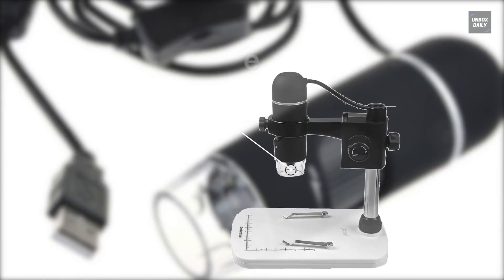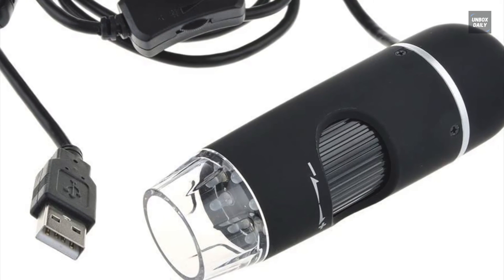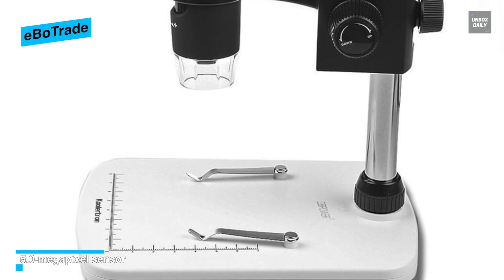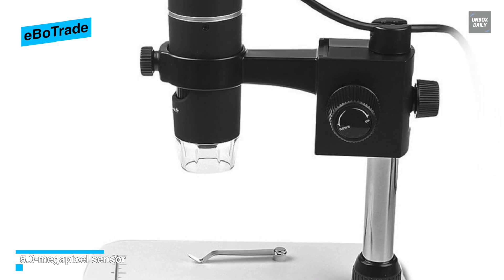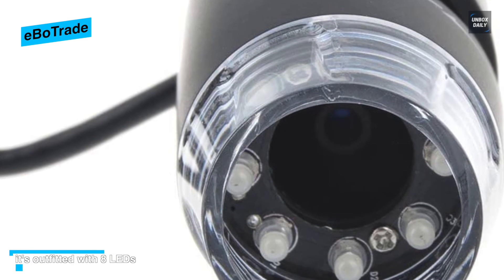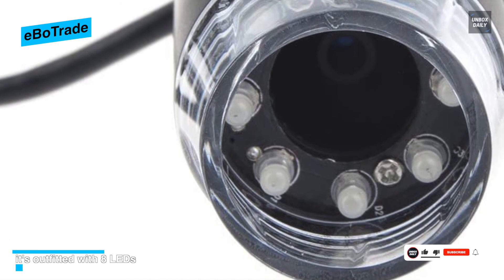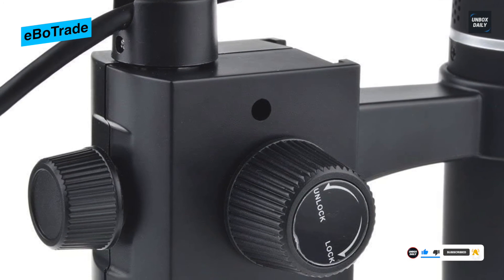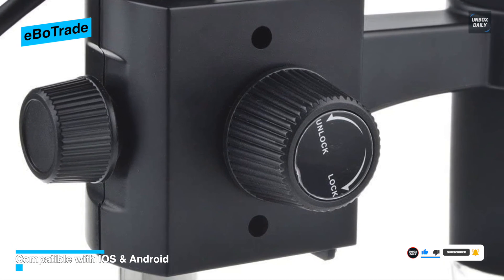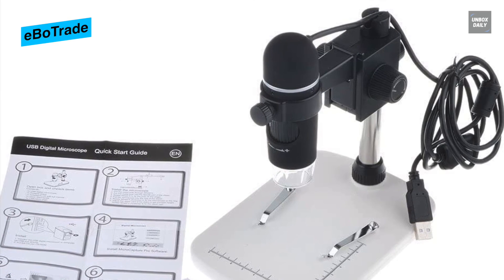Last on our list at number 6 is the EboTrade. It has a zoom range of 20x to 300x and offers USB connectivity to Windows or Mac PCs. Suitable for students, collectors, analysts, and anyone interested in the microscopic world, it features a built-in 5-megapixel sensor and a visual magnifier resolving from 30x. Equipped with 8 LEDs adjustable via a dial, the lighting is not as strong as other models but can be supplemented. Overall, it's a great budget-friendly option that's easy to use and delivers a good image.